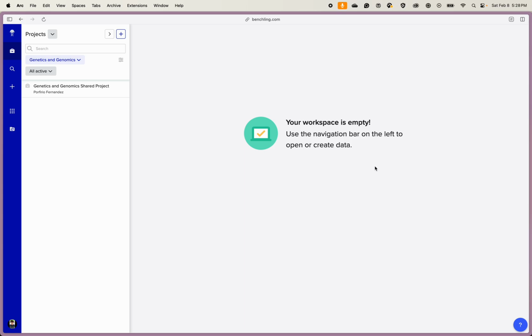I'm going to be posting an announcement, and on the announcement, you're going to have an invite link to the group. Now, one drawback from Benchling is that you have to sign up for it. It's completely free. But I know some people just don't want to sign up for things and things like that. So if that's you, that's okay too. You can just keep using APE. Anything Benchling can do can also be done in APE.